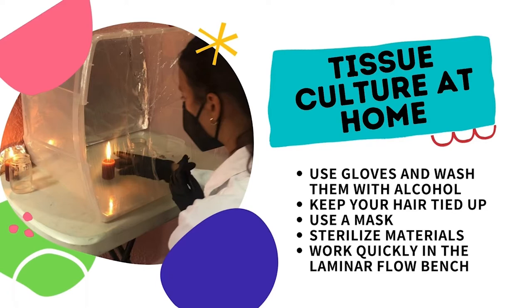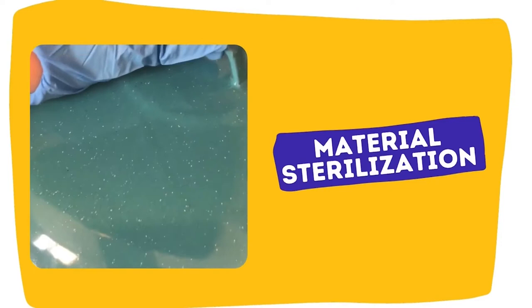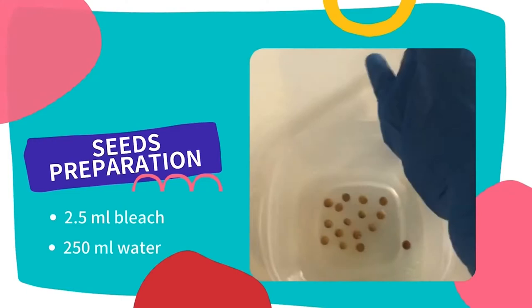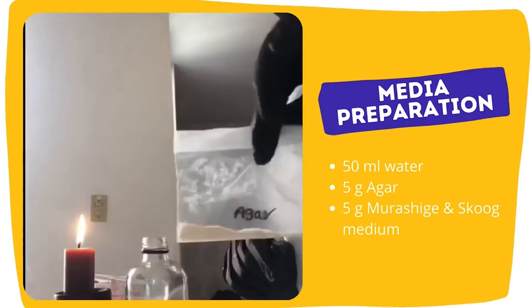Material sterilization. Sterilize the material using heat steam for 30 minutes. To sterilize the seeds, add 2.5 ml bleach and 250 ml of water into a container carrying the seeds. Rinse them 4 times with water and add them into the sterile area.